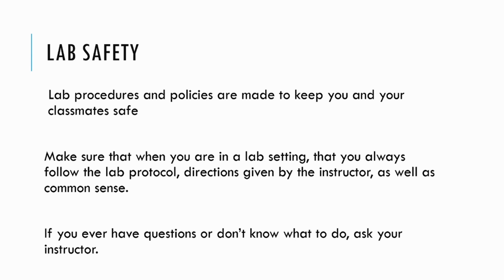And that's really our golden rule when it comes to lab safety. If you ever have questions, or you do not know what to do, or where to put something, or where something goes, ask your instructor. Your instructor will be happy to tell you what you need to do, or where something goes. We would rather you ask and avoid an injury, or a spill, or something along those lines, rather than you just trying to go off and do it on your own. We'll never berate you, we'll never look at you as silly or uninformed because you're asking a question when it comes to safety. And another key thing too, if you see someone doing something unsafe, say something. Everyone is in charge of safety in the lab classroom. If you see something, say something.